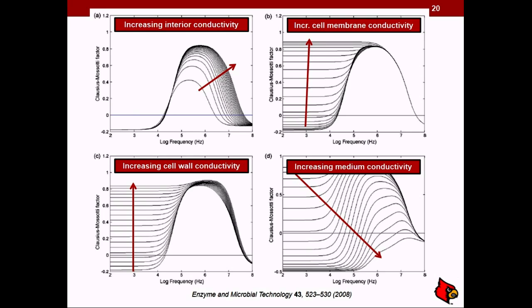If you increase the cell wall conductivity, I'm on the bottom left now, that is shown, or increasing the cell membrane conductivity, or increasing the medium conductivity. That's what these simulations show.